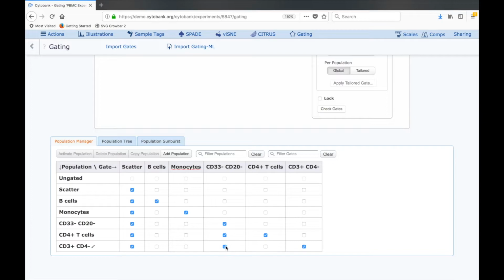If you need to change the position of any one of these, you can do so by either adding or removing these checkboxes in their kind of gate definition.